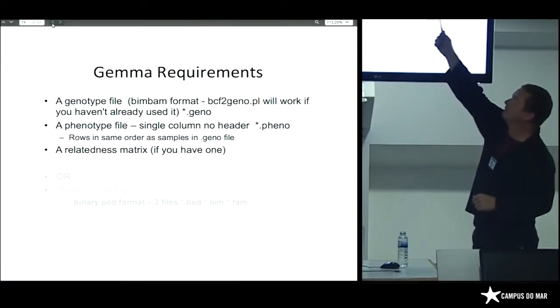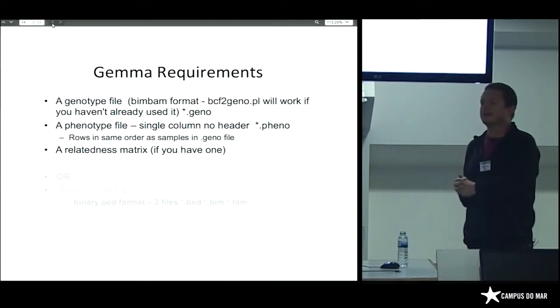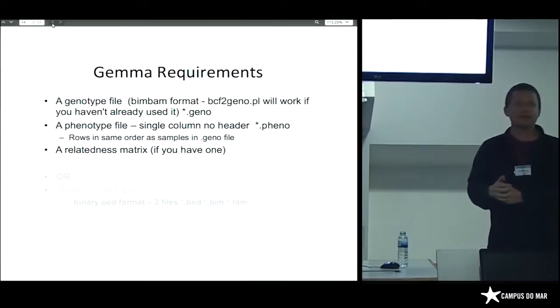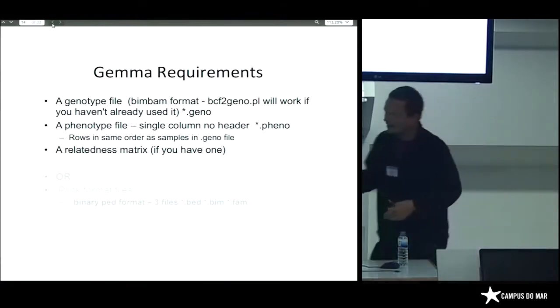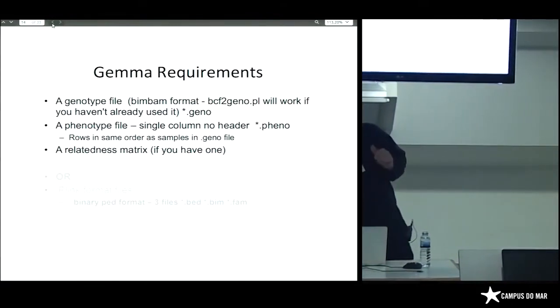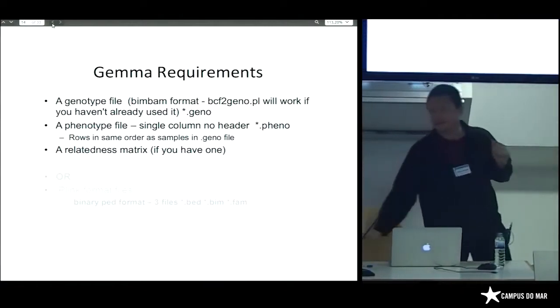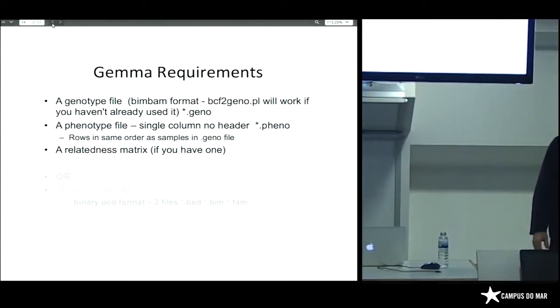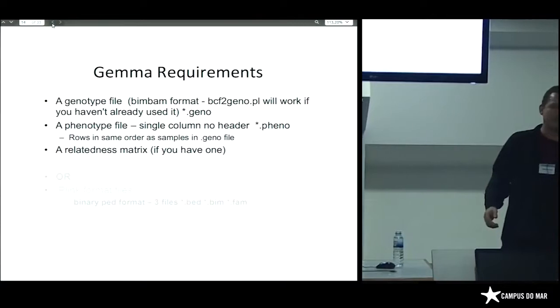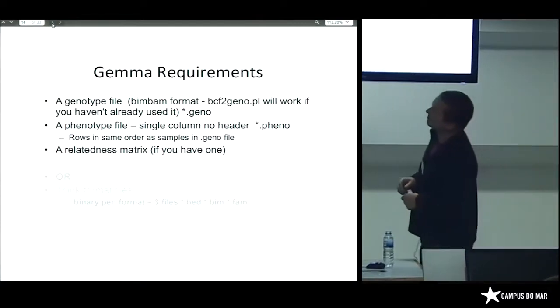It's BCF to Geno. Now, of course, we mapped all our reads onto our de novo assembly, and then we called SNPs overnight. That's why we started up first thing this morning, and here we are, because we called our SNPs last night. Okay, we didn't. But I've given you, in that folder, the BCF file that was called bugsnips.bcf. That's a binary variant call format file, compressed into binary. So we need to turn that into something that has genotype approximations in it.